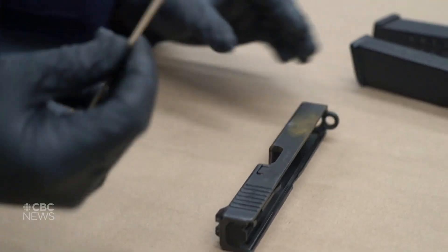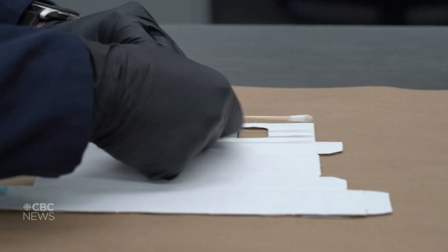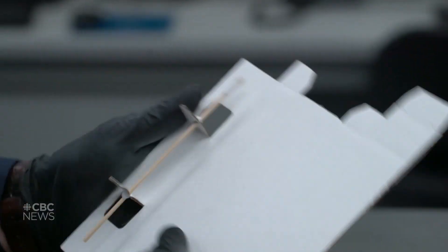Once I'm satisfied that I've covered enough area with the swab, I will seal it up into a swab box, and then this gets packaged up.